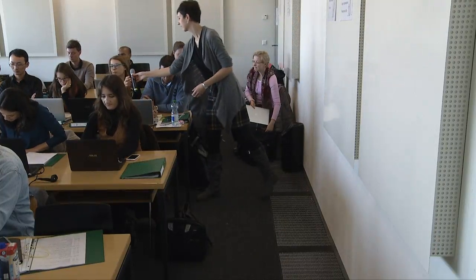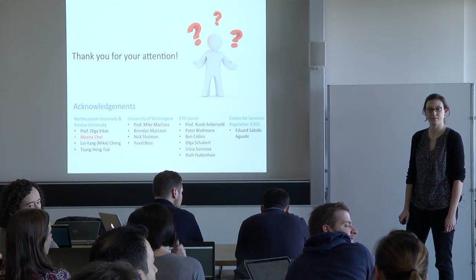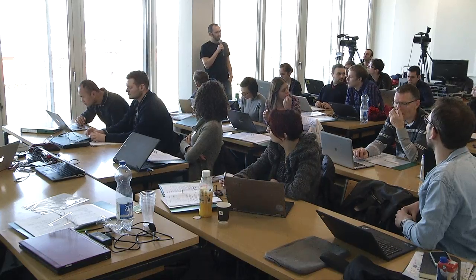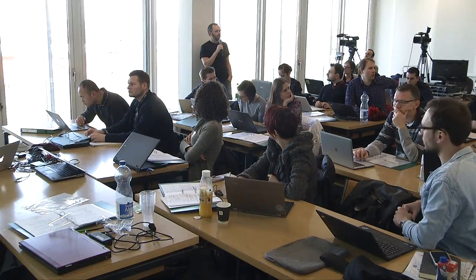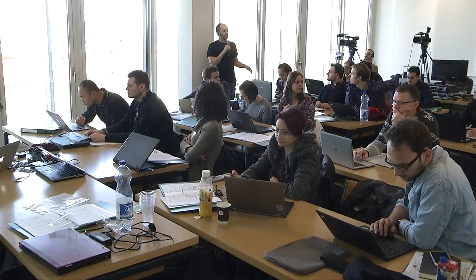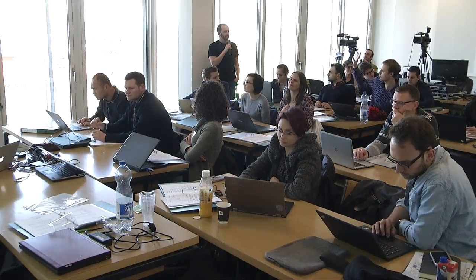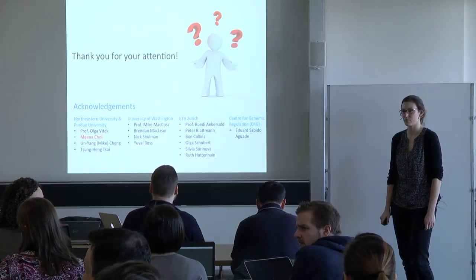I guess maybe one difference is that MaxQuant does the imputation differently than MSstats, right? They have some simulation. Do you have a comment about the difference between these, or does it make a big difference? I mean, they seem to say that having a distribution that represents the noise and then sampling from it is for some reason useful. Yeah, I don't know all the details of what they do.